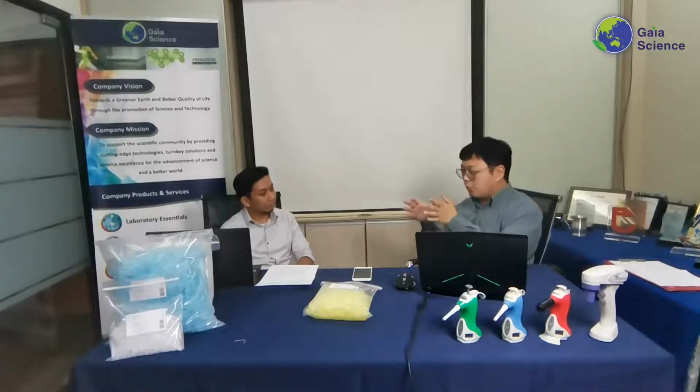There is a whole group that is branded to a specific brand of pipette. Now, the catch is that when you get those kinds of pipette tips, they have already been properly tested to fit perfectly into their pipette, and that takes a lot of time, research and perfection.